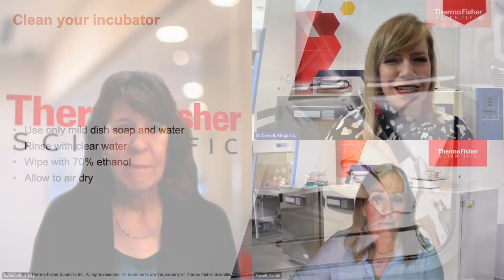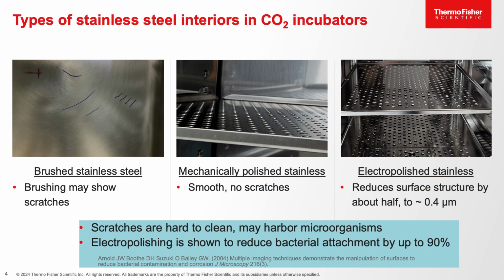Thanks, Callie. That sounds easy enough. I think I could clean these incubators behind me doing that. Are there any interior treatments that could make it any easier to clean? Absolutely. A great example are the different finishes of stainless steel that we see in CO2 incubators. Essentially, the smoother the stainless steel, the easier it is to clean. For context, some CO2 incubators are finished with brushed stainless steel, or some are polished.